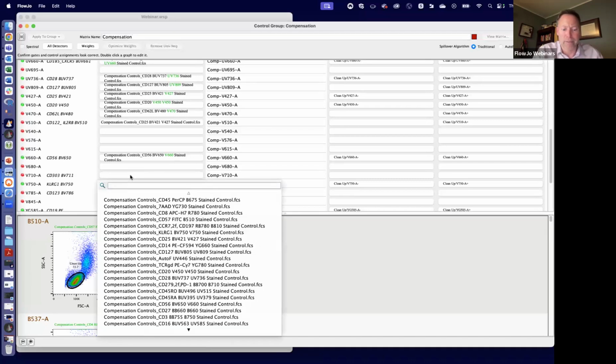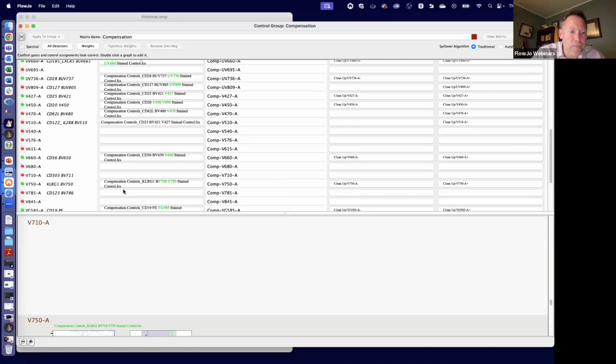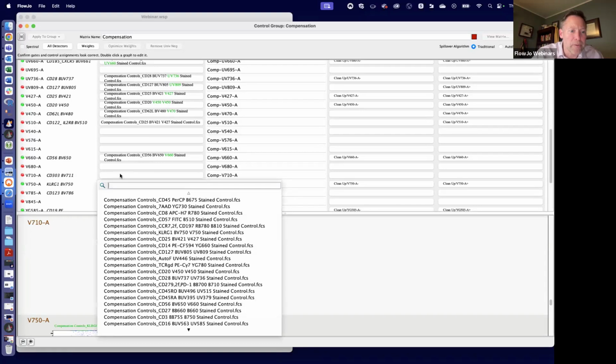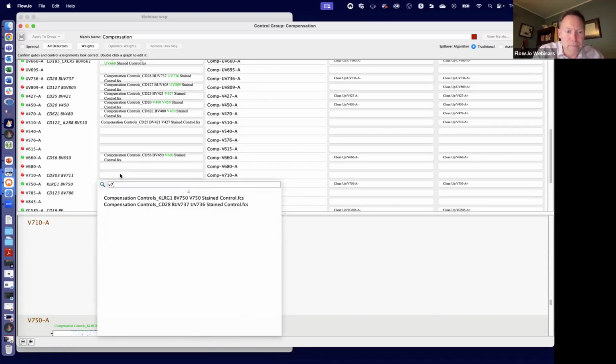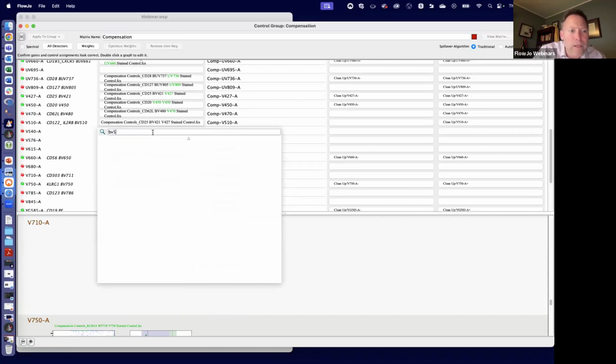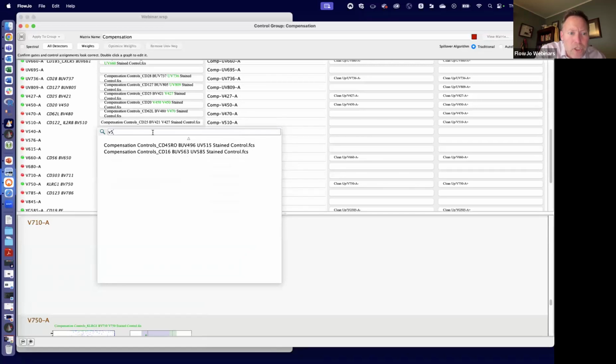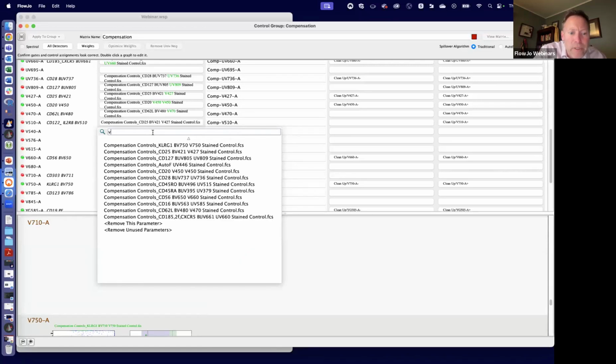Okay. And so here's just another case of the controls being shifted by one in a couple of places compared to what the original panel designer wanted to do. V510 seems to have CD122, but you selected CD25. Oops. Good call. What is that under V510? Where is that one? All right, well, we maybe don't have that one in this panel either. Let's remove that one then.